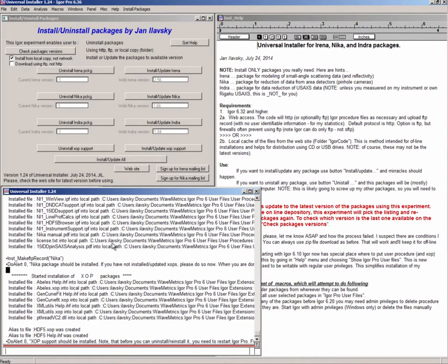So that is done here, and you can again see here that it has installed the files. Now, if there were any troubles, and typically there wouldn't be when you are using a local copy, but if you have HTTP problems getting to a repository installing from the web, there would be a record here of which file failed and why and how, and in that case you can send it to me via email, and I can look at it and see why it failed, if there's something I can figure out. Anyway, for now it looks like we installed everything.